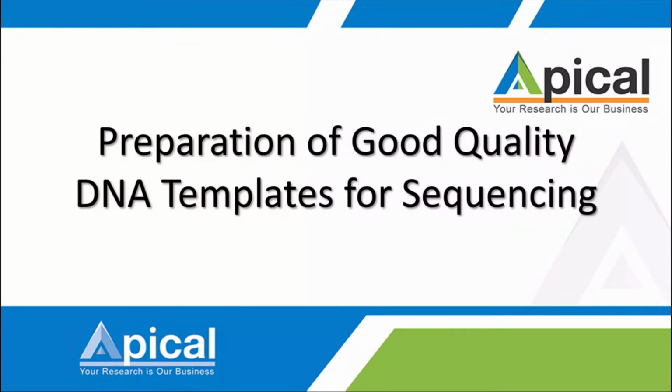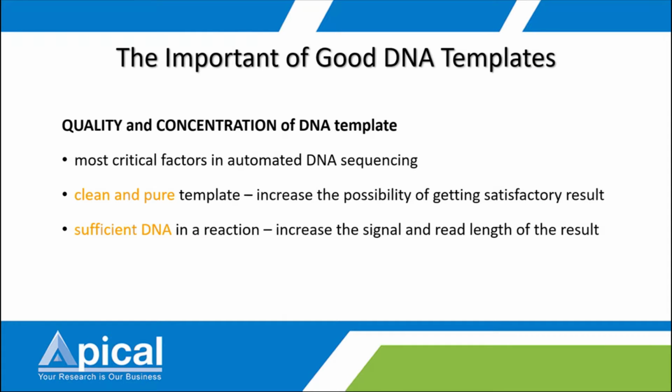Okay, so let's go into how to prepare a good DNA template for your sequencing, and why it is important. A good quality DNA template means a clean and pure template, clean from inhibitors or any contaminants, which increases the possibility of getting a satisfactory result.